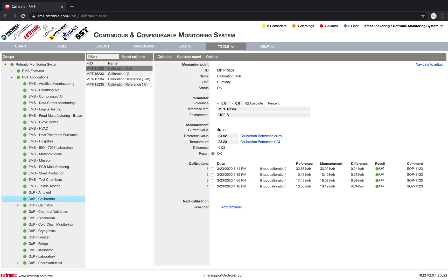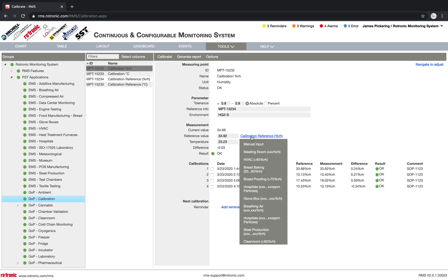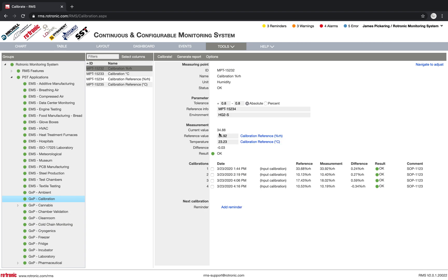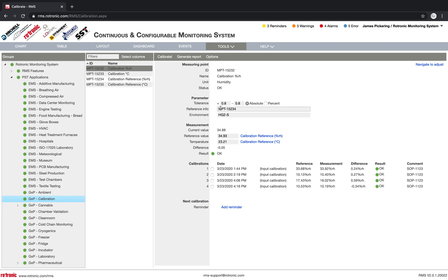And the environment is a HygroGen. So here, RMS reads directly the value of the probe, the MPT15232. And the reference value, I can either select manually or I can select from a drop-down list, all of the various points. So here, I've already selected calibration reference. And we can see here, my current value is 34.88. My reference value is 34.92. The temperature is 23.23. So this is from my reference device. And I have a difference of 0.05% relative humidity. And the result is okay. This result okay here comes from the tolerance that we've put above here.